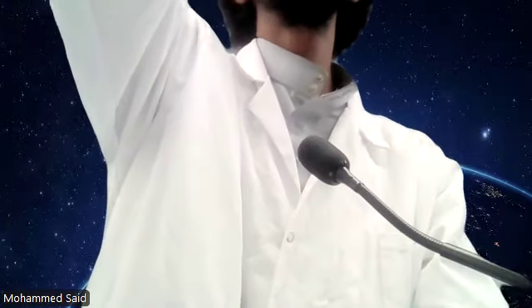For the catalase test, for the antimicrobial susceptibility test, if possible, as well as the coagulase test, which we'll talk about, you'll see the other materials in that bin beside you. So just bear that in mind, folks. You guys can continue.